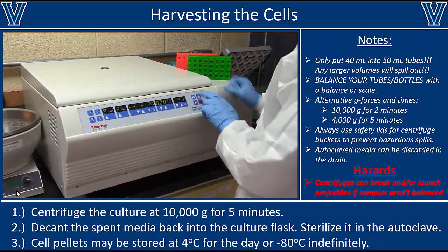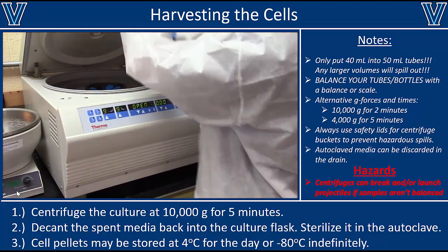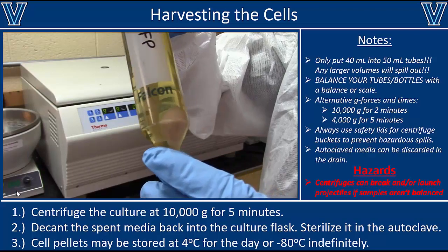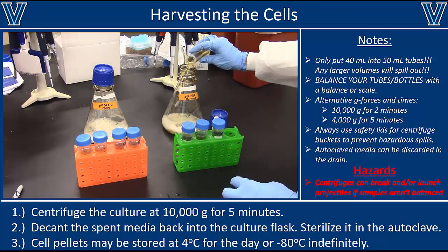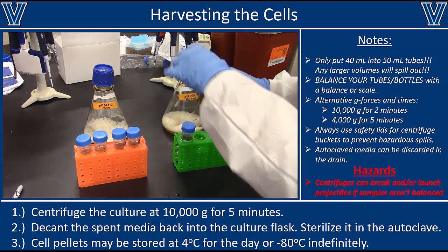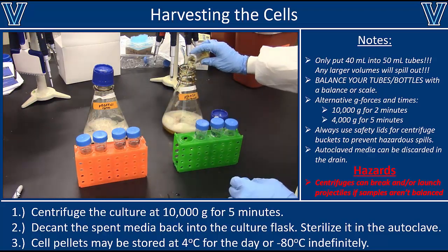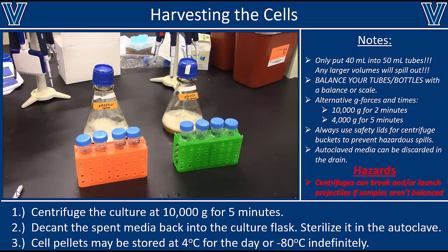After the spin, carefully remove the tubes slowly so you don't disturb the pellet — you should see a solid pellet at the bottom with clear liquid above it. Decant that clear liquid back into the original culture flask. You can then autoclave both the flask and the spent media together to kill any leftover bacteria, and after that pour the spent media down the drain because it's completely harmless. The clean flask can be reused for another culture.